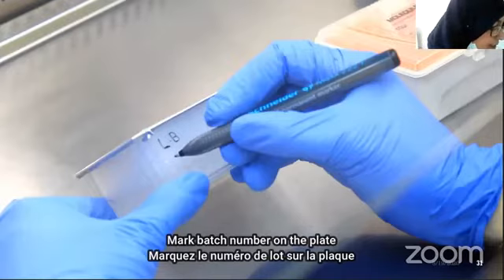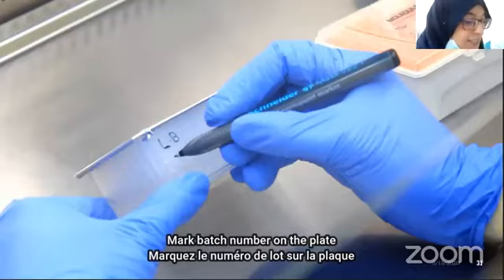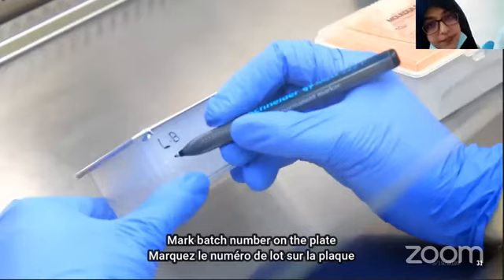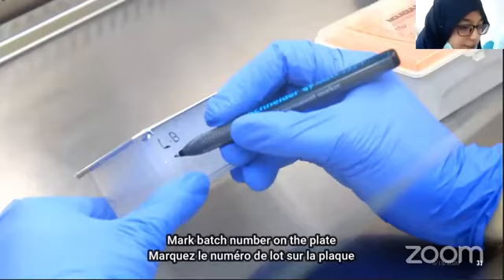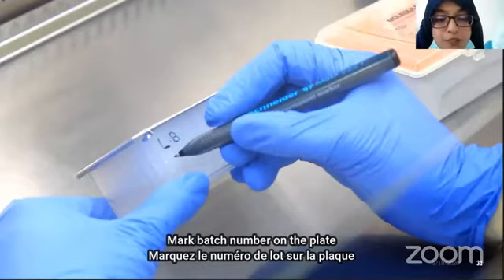The first question is this: how could you extract RNA without fresh condition? If you are asking about the sample present in the VTM, it depends upon the VTM. Different types of VTM have different sample preservation times, but it is advisable that you process your sample within 24 hours or store the sample at 4 degrees centigrade within 24 hours.